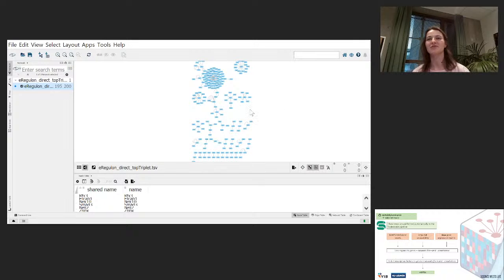So yeah, then we can do this with different combinations or different selection of the target regulons, or we could, for example, take the most enriched or most specific based on the RSS scores for a certain cell type and investigate which interactions we can find there as an example. Yeah, so I give the word back to Seppe.